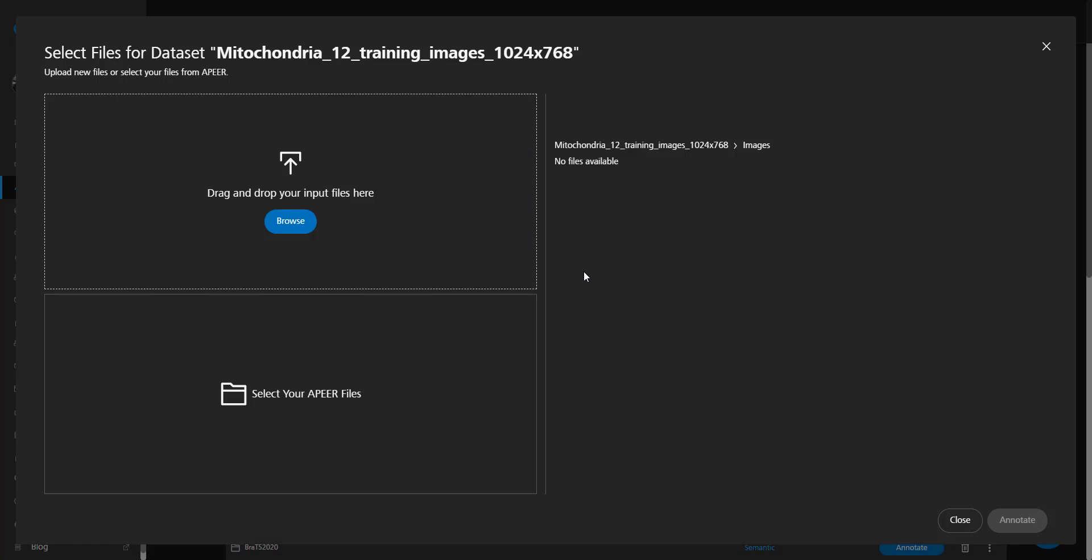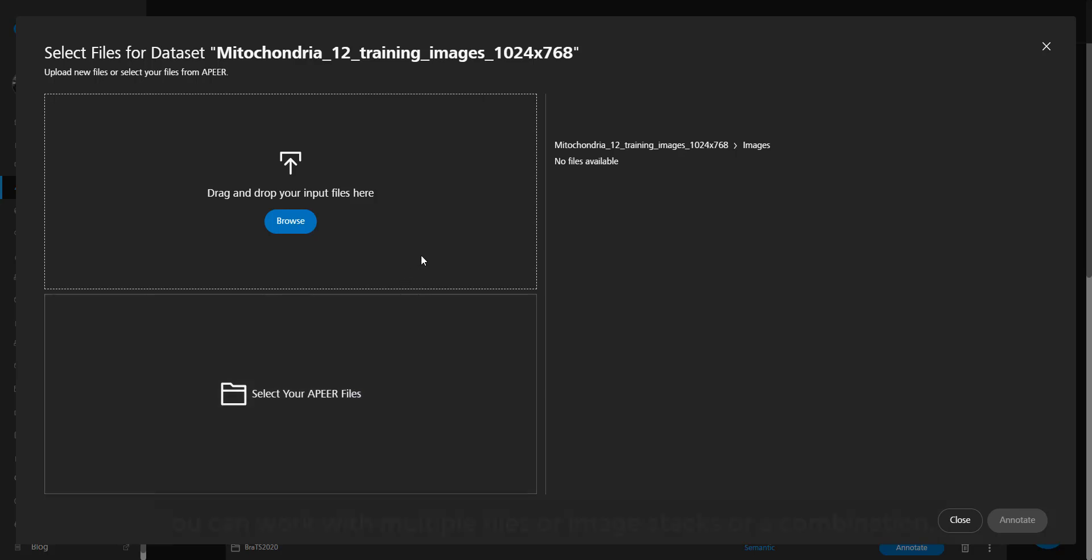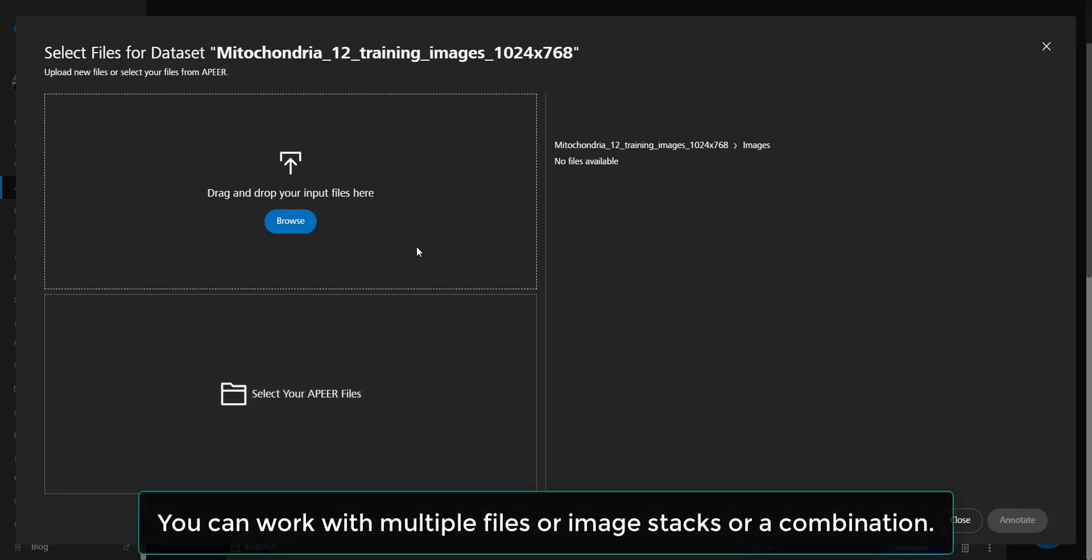To create your training dataset, you can upload your images or select existing images on your APEER storage. Please remember that you can work with multiple individual files or stacks of images.